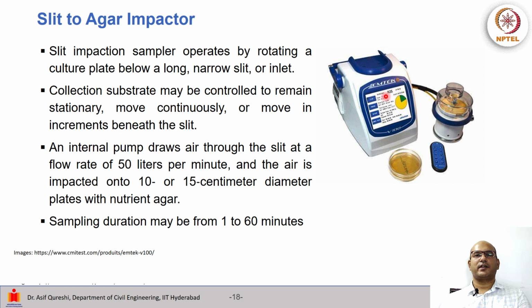The sampler is drawing the air, and the culture plate which is below the slit may be kept rotating, so that may somehow enhance or improve the collection efficiency of the microbes. Sampling duration can range from anywhere between 1 minute to 60 minutes.